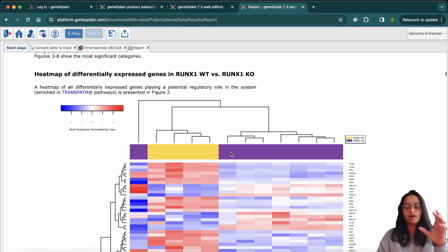So we are going to go over the details of this report, as there's a lot of information contained in it. We are going to go over each of the sections and briefly discuss various insights that have been reported in this final output report.